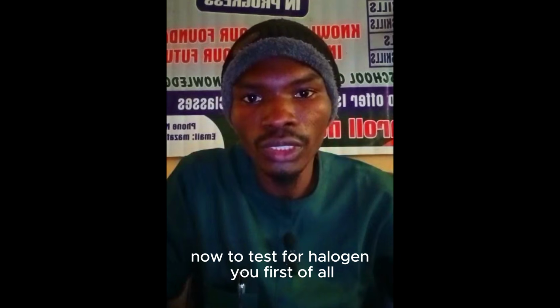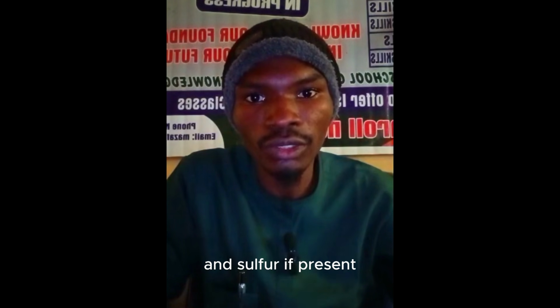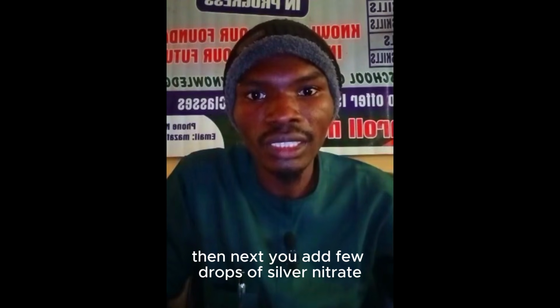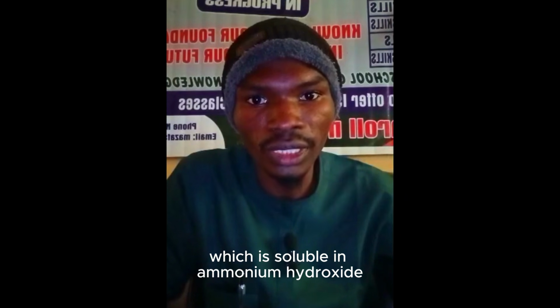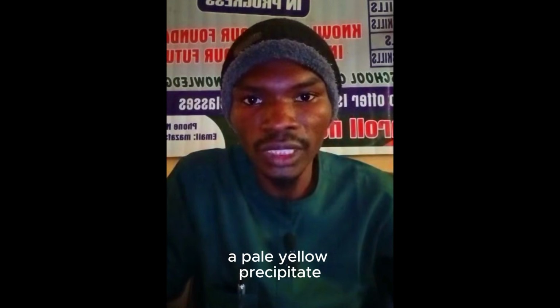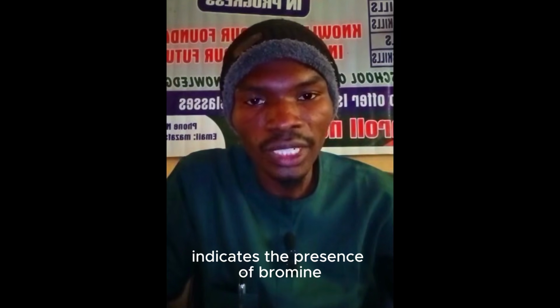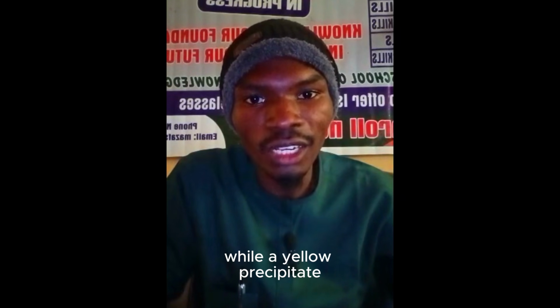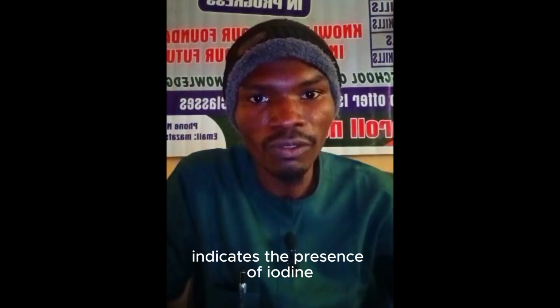Now, to test for halogen, you first of all acidify it with HNO3 to remove nitrogen and sulfur if present. Then next, you add a few drops of silver nitrate. A white precipitate which is soluble in ammonium hydroxide indicates the presence of chlorine. A pale yellow precipitate which is partially soluble in ammonium hydroxide indicates the presence of bromine, while a yellow precipitate which is insoluble in ammonium hydroxide indicates the presence of iodine.